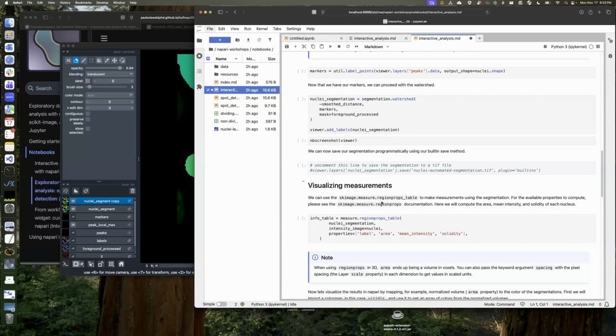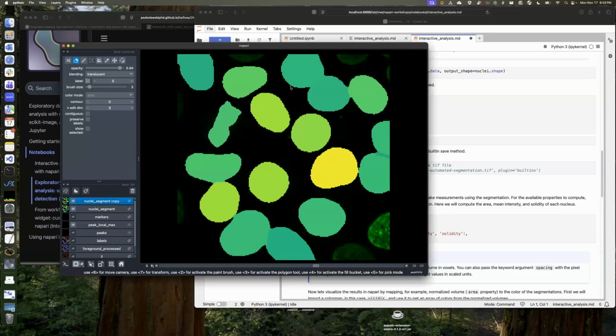There is a library called Napari ImageJ to use them together. I've never used that, and I'm not sure how useful it is. I find that something like watershed segmentation is a standard algorithm, or Otsu threshold is a standard algorithm. Why would I want to use the Fiji version in Python? Or in Fiji, why would I want to use the Python version of Otsu segmentation? But I'm sure people do use that package. I think it's actually a plugin.